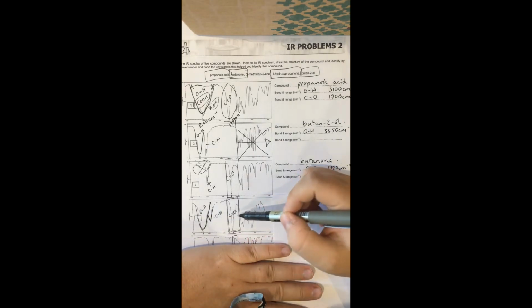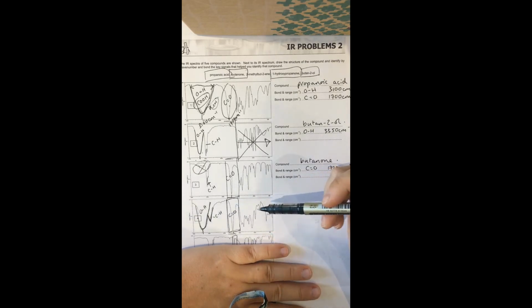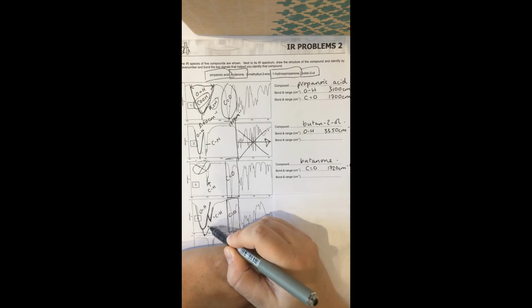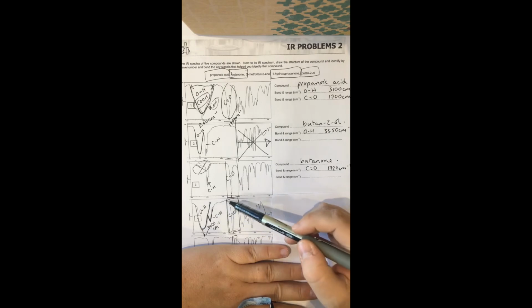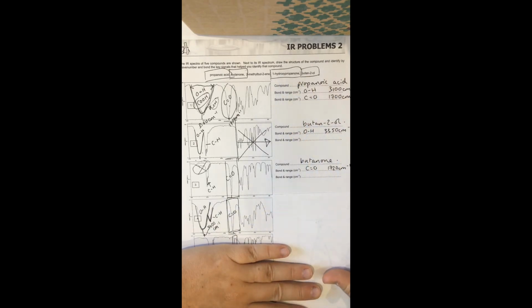So usually when we have both of those, the first thing we would think is that this molecule is a carboxylic acid. But actually, because your OH peak is at around 3,400 wave numbers, that's too high to be a carboxylic acid. So what we're looking for is a molecule that has an alcohol functional group and a carbonyl group. So this is 1-hydroxypropanone.